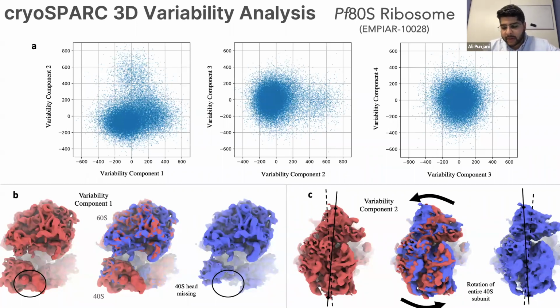And of course, there can be other kinds of changes that have other dynamics as well. Like if you have a ligand binding or some other kind of irreversible event, or equilibrium process, you may have some particles that are on one side of it or the other, and that may also be a continuous process. But it's almost all driven thermally. Hopefully that answers the question.